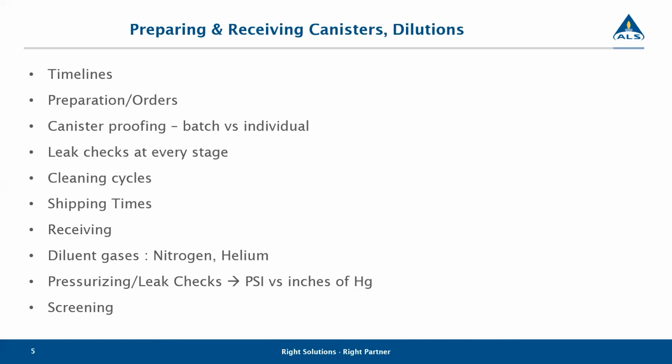So in our process, while we do not have staff in the lab for the full 24 hours, we do have the lab staffed about 20 to 22. The equipment and cleaning equipment runs 24/7 and also runs on the weekends.